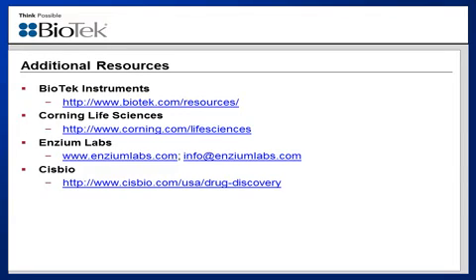Okay, the second is, do you have a list of cell lines responsive to CXCL12 in this assay other than MDA-MB-231? I do not.